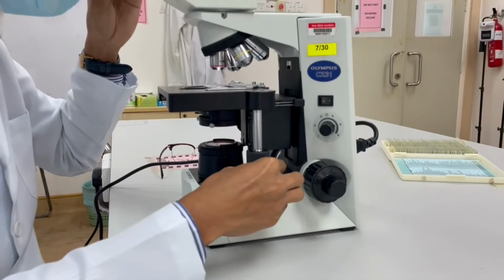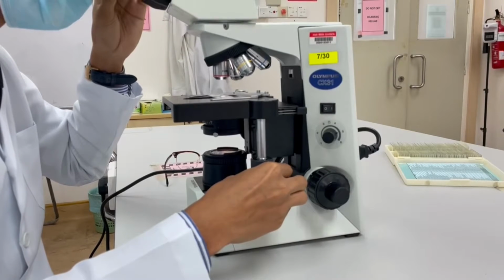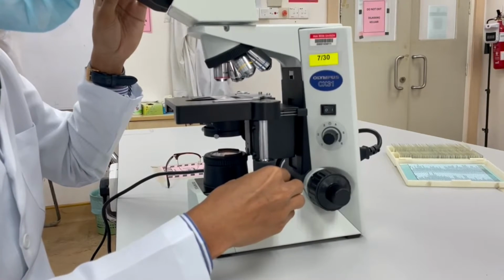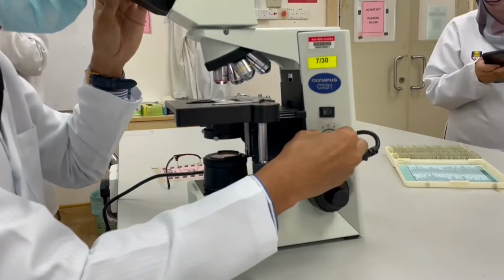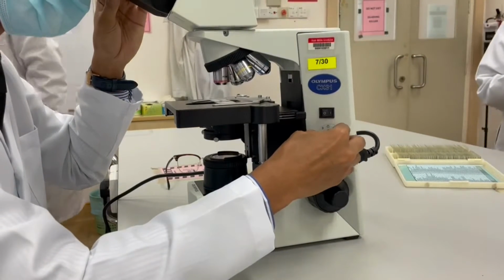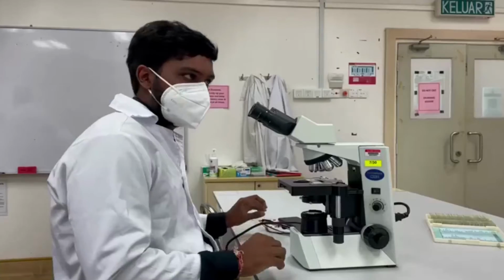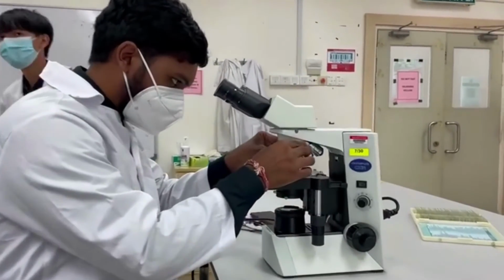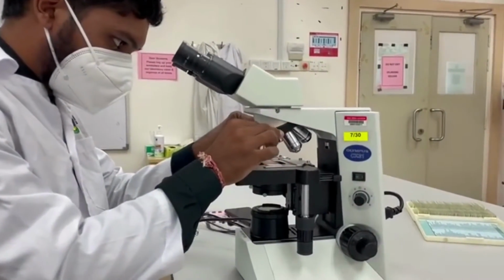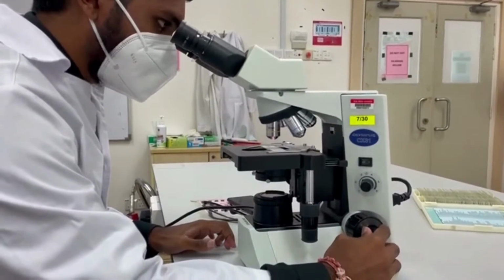In this case, we will never know if the slide isn't centered unless you look with your eye rather than the microscope. If it's off center, you will never get a glimpse. That's why we need to adjust the XY translational knobs and the light sources in order to get a better view of our specimen. When done looking at low power, rotate to the medium or higher power objective lens, then focus using the fine focus knob. You'll be able to see much more of the specimen in higher detail.